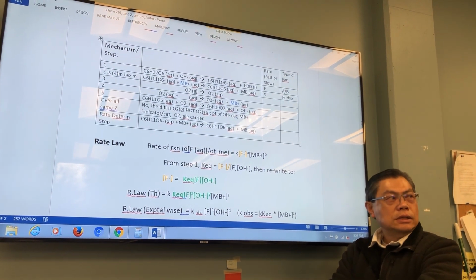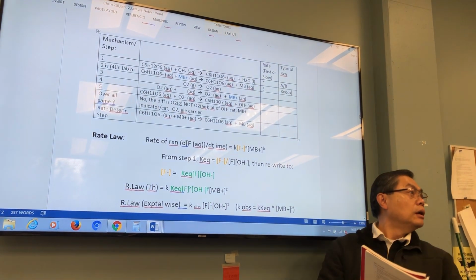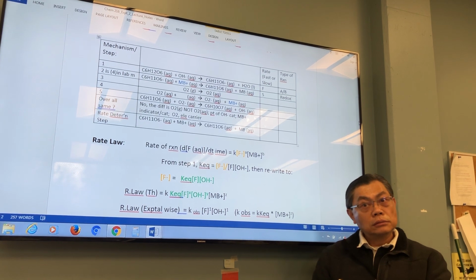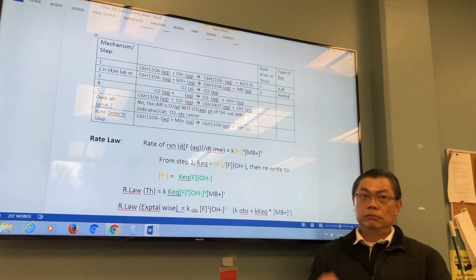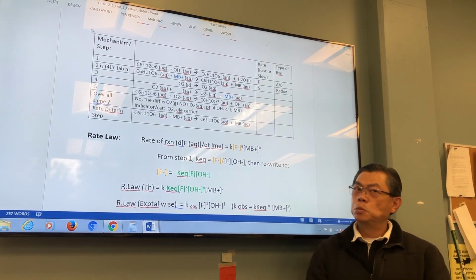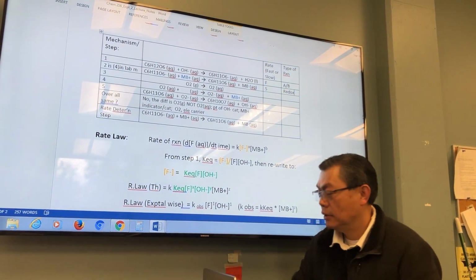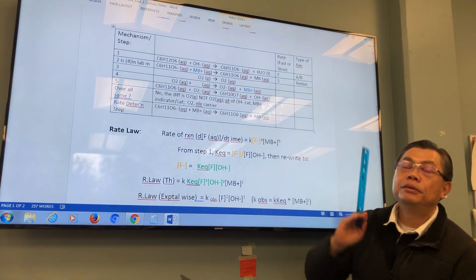Yeah? Now what did we say in our title? Oxidation of fructose. Are we timing and monitoring this step, oxidation of fructose? No, we are monitoring the reduction of methylene blue.